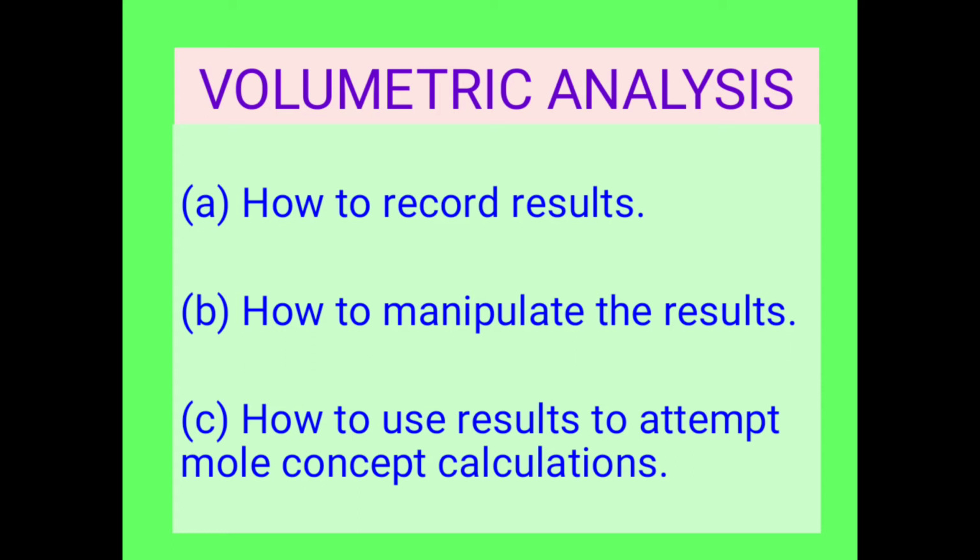In our previous lesson, we looked at following instructions. We are going to look at volumetric analysis, and there are some important concepts that we are going to handle under this. First, we shall look at how to record the results. We shall also look at how to manipulate the results or deal with the results. We shall also look at how to use the results to attempt mole concept calculations.